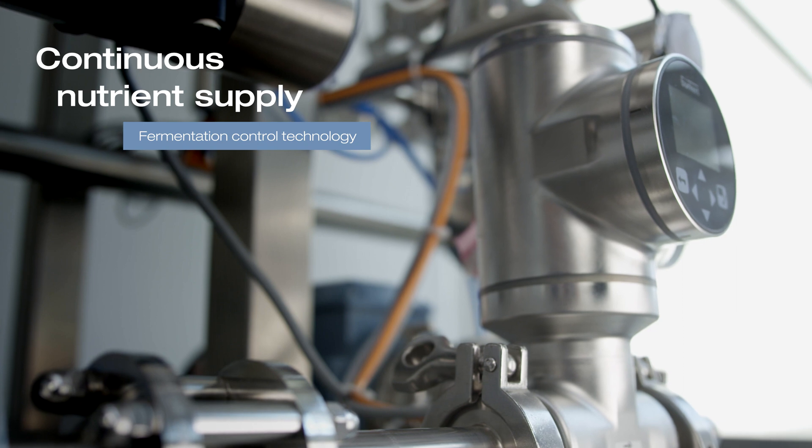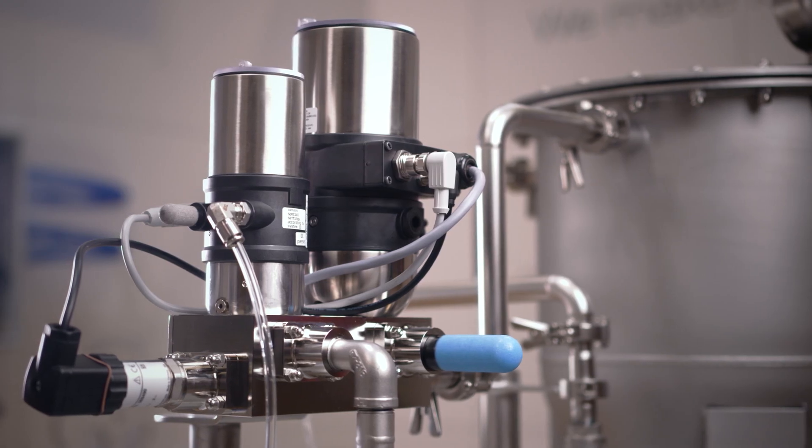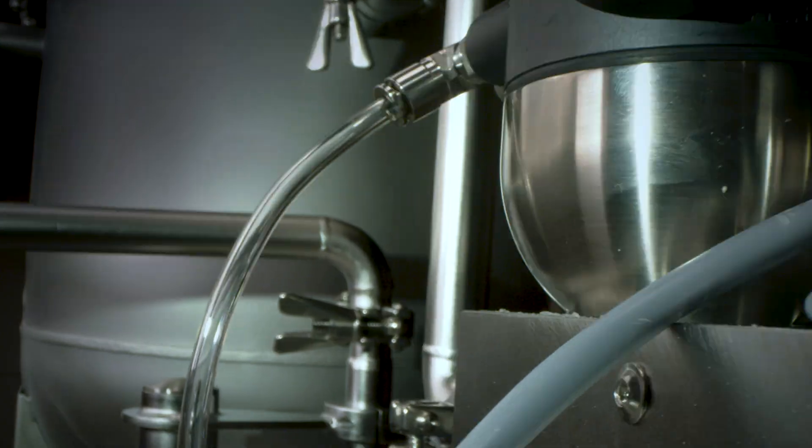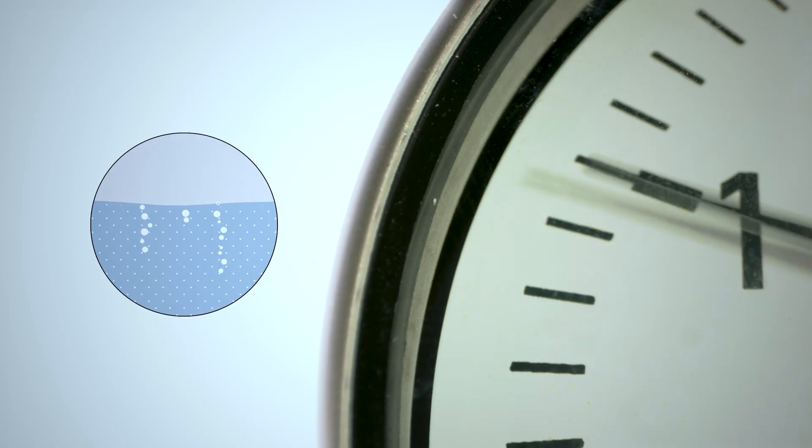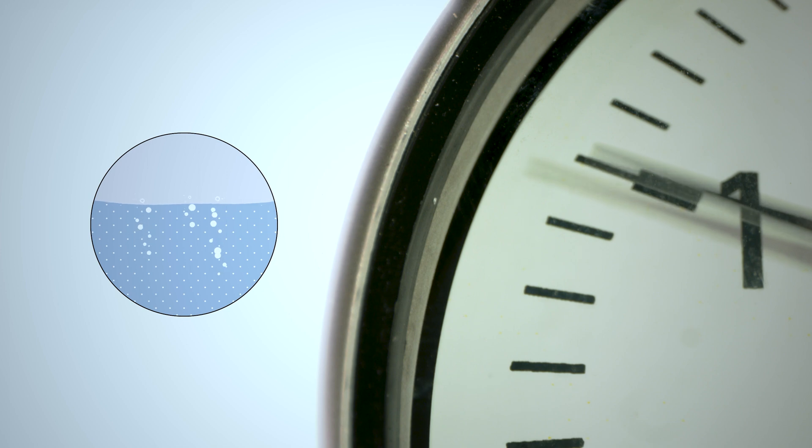Burkhardt ensures that a local control circuit for supplying nutrient solutions is combined with individually designed components. Precise dosing is guaranteed, which adapts to the variable requirements in the fermentation process.